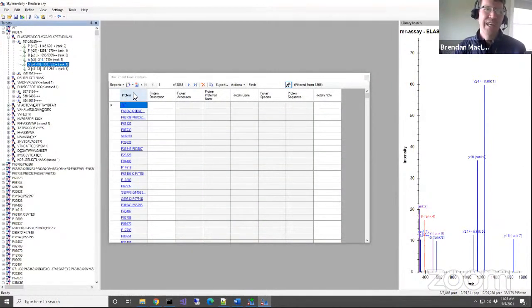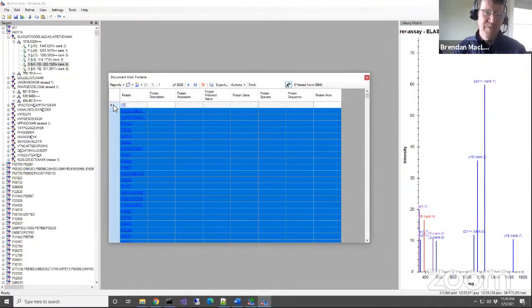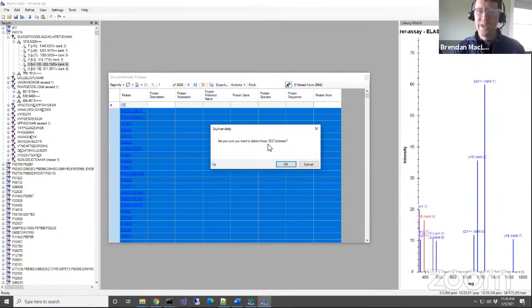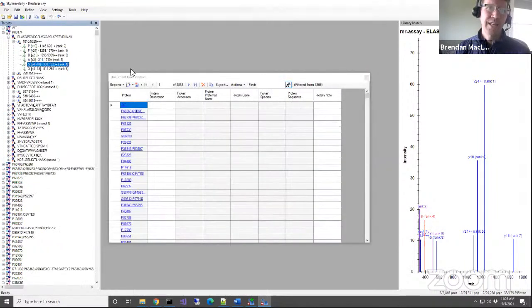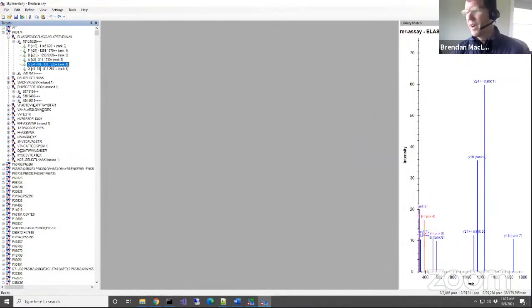Now I'm going to go back, and I think I still have that, but I'm going to delete everything except for this IRT row. And so it really just depends on your selection here, and you can do fairly massive deletes and filtering, and so lots of power, lots of things that can be done. I definitely recommend that people learn how to use this report grid. It's very, very powerful. I'm going to undo that, get back to my file. All right.